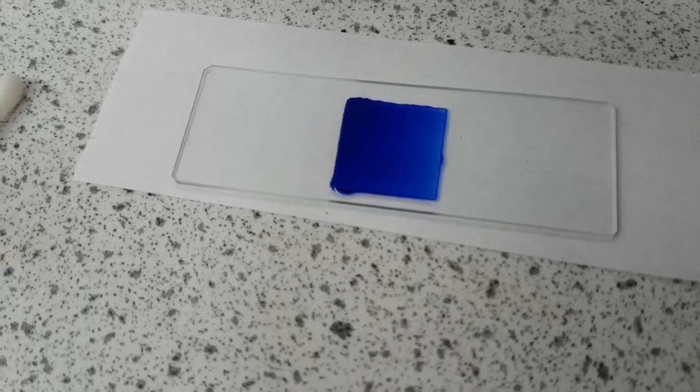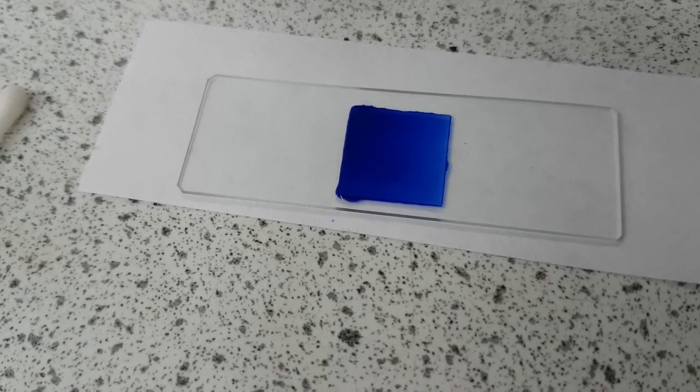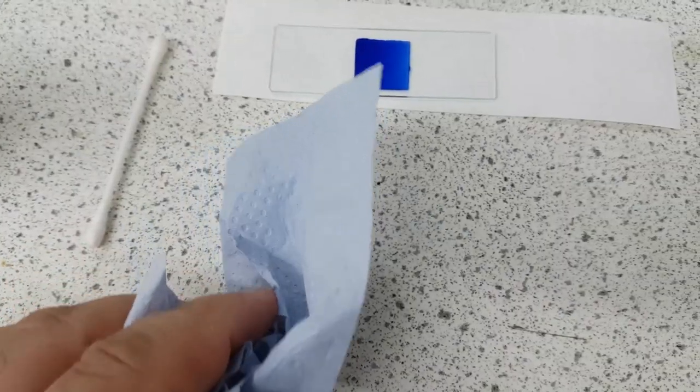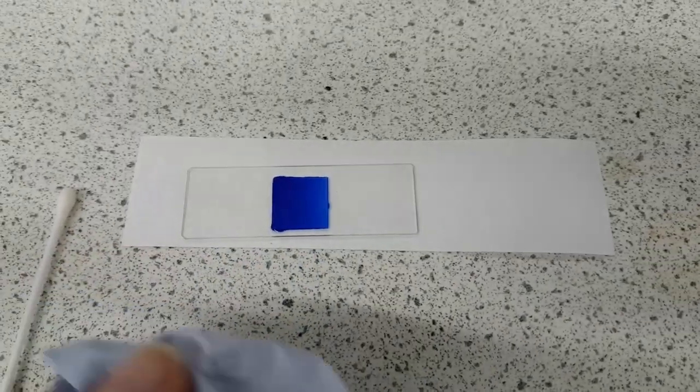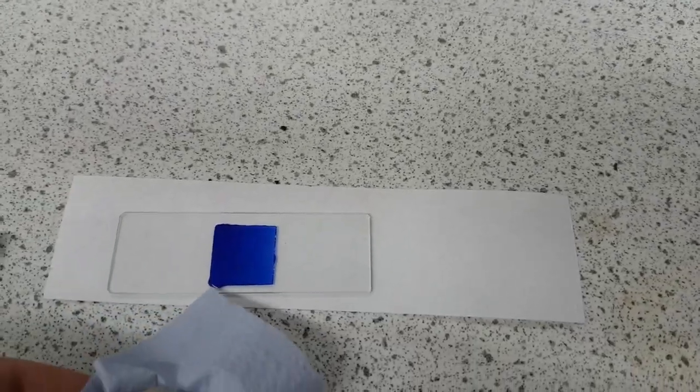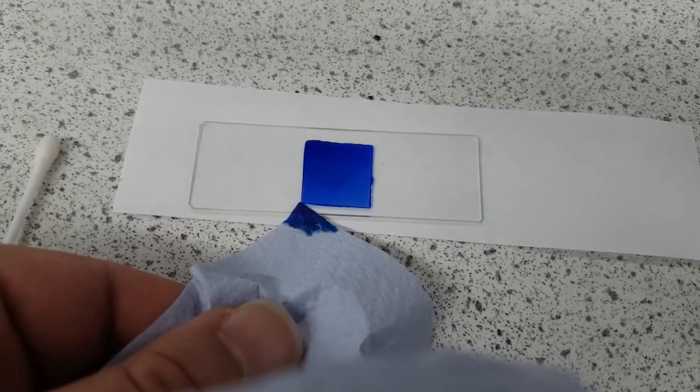So what we're going to do though is we want to absorb some of the excess methylene blue solution and we do that using a paper towel. Let me show you. So here's my paper towel and I'm just going to literally just place it where the methylene blue is and just absorb it.